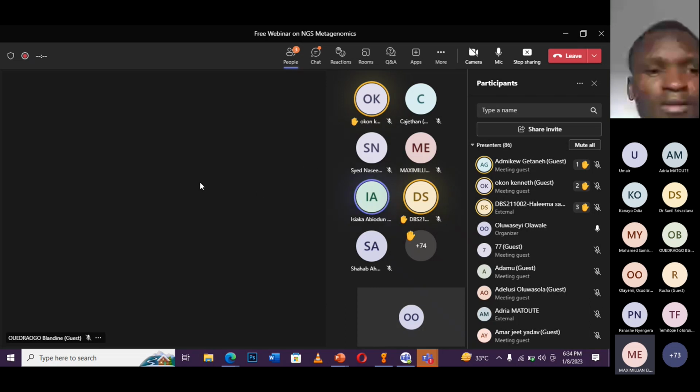And as touching clinical, like he said, it can also be used for outbreak detection. It can be used for surveillance, like what I said previously, because by the time you're doing that, you are trying to figure out mobile genetic elements that are common to different microorganisms present in that specific region.